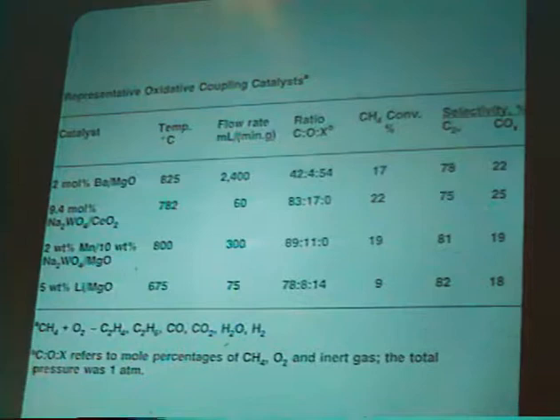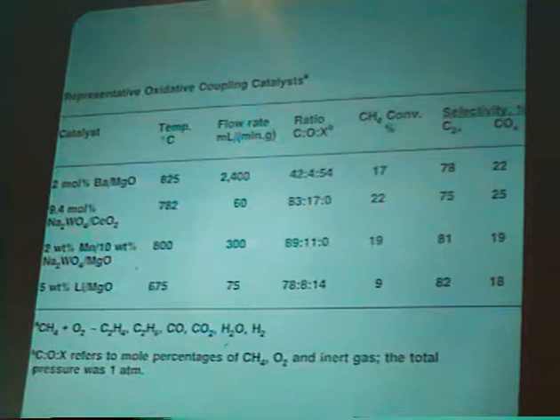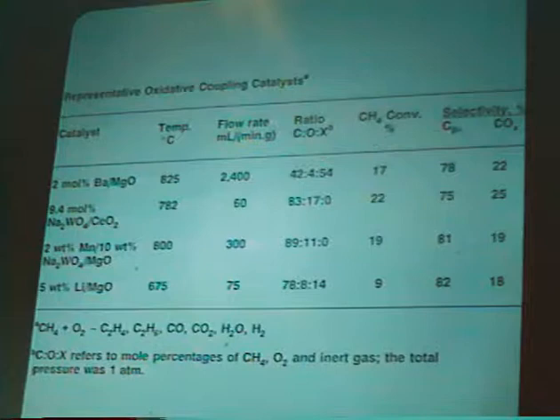So these are catalysts which operate at high temperatures, and one of the points that I want to stress in this talk is the applicability of Raman spectroscopy to deal with and to make in situ measurements at these very high temperatures. And as far as I'm aware, I think no other type of spectroscopy could function at these temperatures and enable one to carry out in situ experiments on catalytic samples. And so in this sense, Raman spectroscopy is a very powerful technique for examining catalysts which operate under extremely high temperatures.